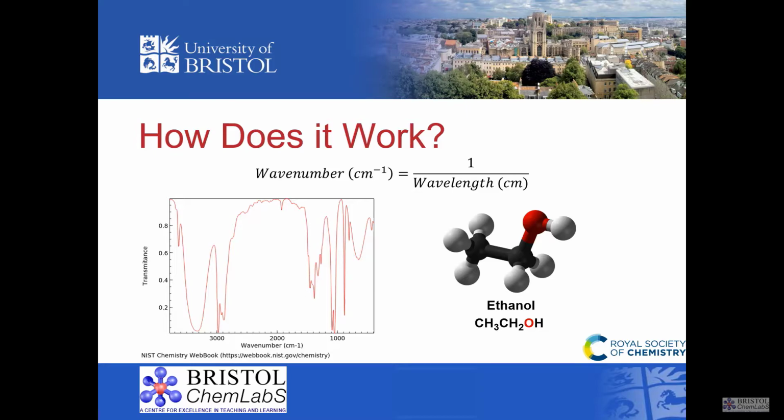And from 1500 to 400, you get the absorptions owing to other bond deformations, and this is usually called the fingerprint region. In the case of ethanol, 3 sample absorptions have been picked to show you the bond vibrations which produce them. In yellow, we have the energy absorbed by OH stretching. In purple, CH bond stretching, and in red, CO bond stretching.